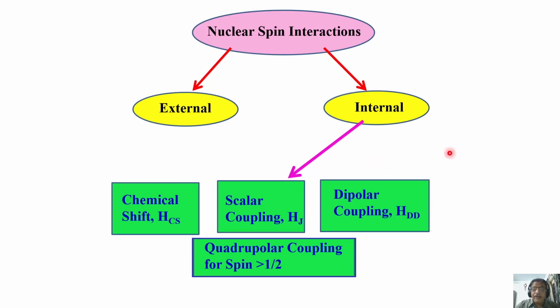We can also think of another type of interaction called dipolar coupling. What is this dipolar coupling? For scalar interaction, we required a chemical bond. Think of a situation where there is no chemical bond. A big molecule is there, which in a three-dimensional conformation has two protons which may be separated by several bonds. Doesn't matter. But when you see them spatially, they may come close to each other. Very close, within 2 or 3 angstroms, or 3-4 angstroms, let us say. They come close in space.